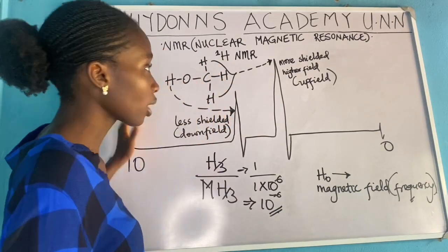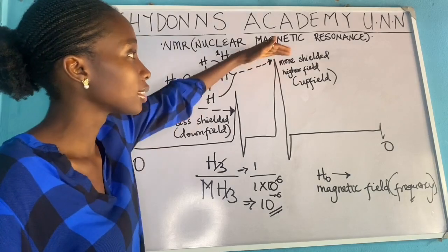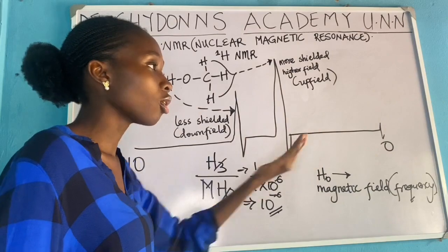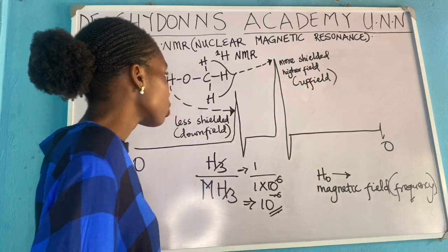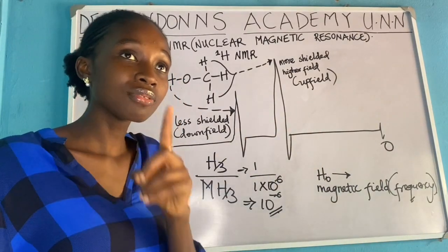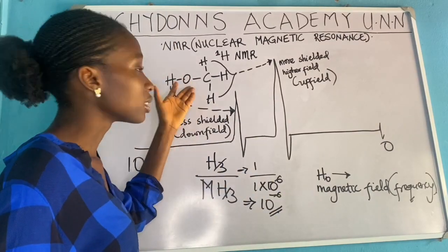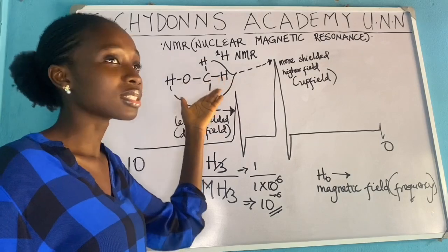And so on this side, talk about the peaks and their heights, and then on the x-axis, or the horizontal axis, talk about the upfield and downfield effect. So now, like we said, hydrogens live in what? Chemical environments. You have the hydrogen. This one is beside an oxygen here. This one is beside a carbon.